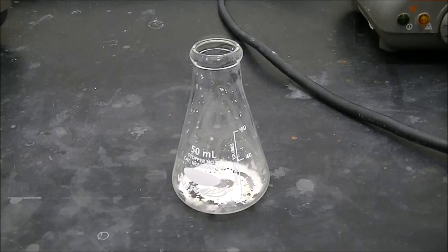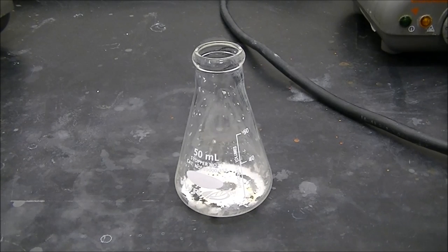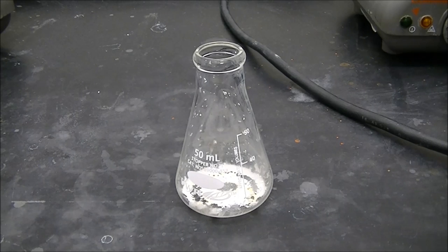Once the methylene chloride has evaporated, you'll have solid left in the bottom of your Erlenmeyer flask. Measure the mass, calculate your percent yield, and run an IR.